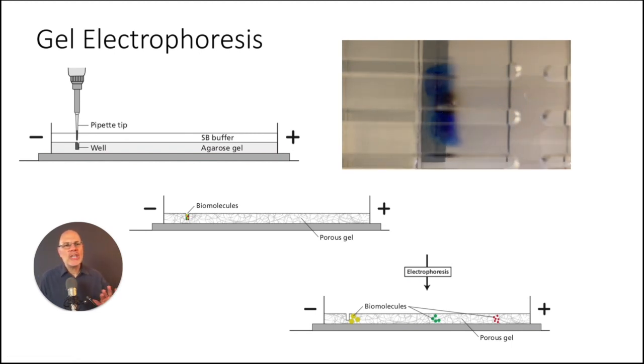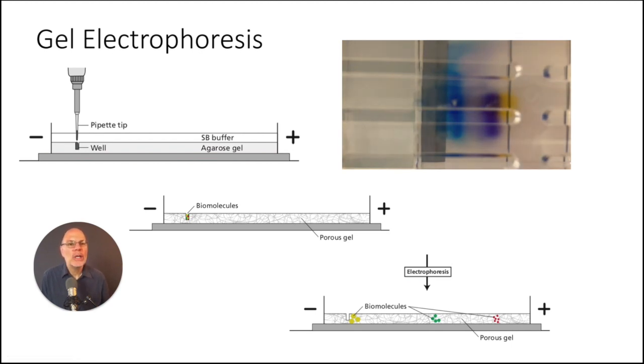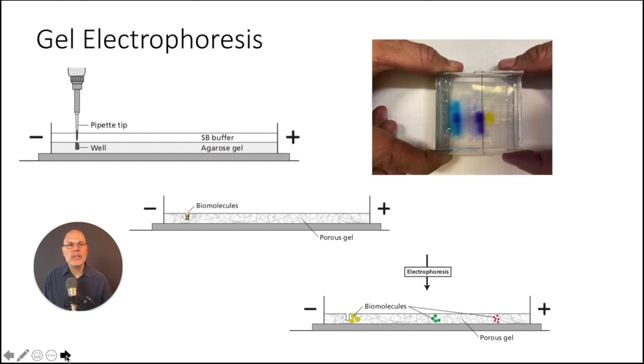What you can see is that the ink is getting pushed across the gel underneath the liquid. It's being separated out, and you can see that some of these inks actually have component colors that make them up. And so here it is. We're running to the end of the gel, and we're going to stop it. And now on the next slide, we will take a closer look.